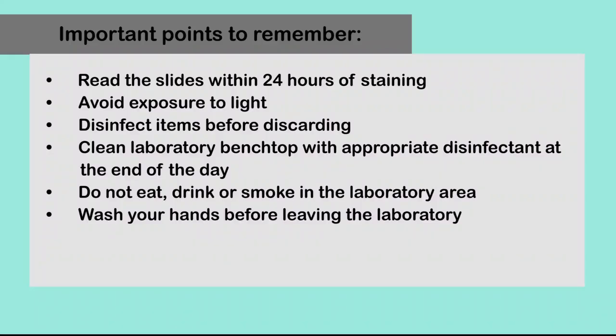Important points to remember. Read the slides within 24 hours of staining. Avoid exposure to light. Disinfect items before discarding. Clean lab benchtop with appropriate disinfectant at the end of the day. Do not eat, drink or smoke in the lab area. Wash your hands before leaving the laboratory. This concludes the training video, Auramine O fluorescence staining method for microscopic detection of acid-fast bacilli.